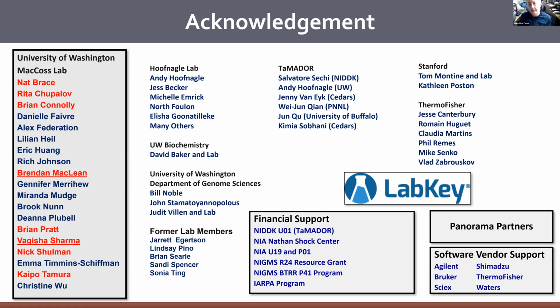I think the key thing is to start with the panoramaweb.org server. You can request an account. There are some tutorials, and there are some great saved webinars and videos up there. It's hosted at the University of Washington and is completely free to use. If you have questions and feedback, there's a support board that's monitored.